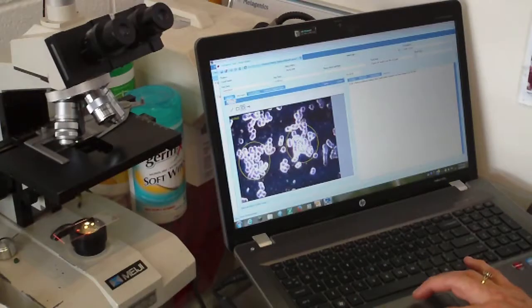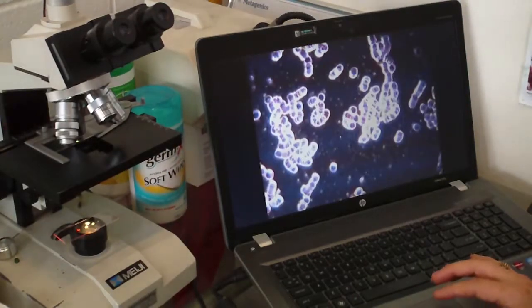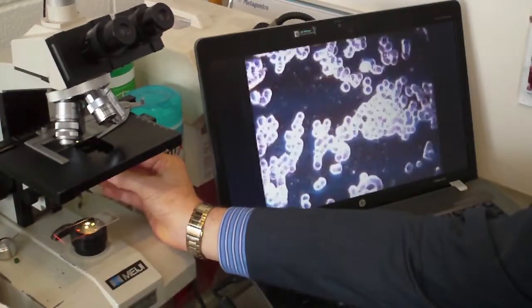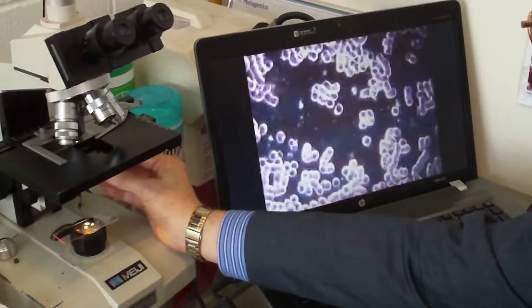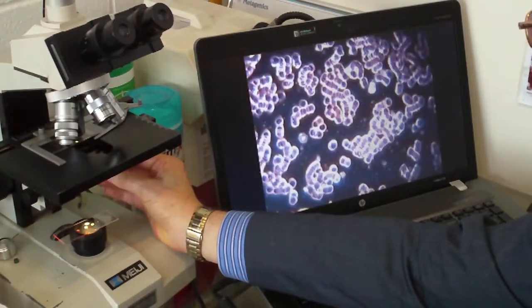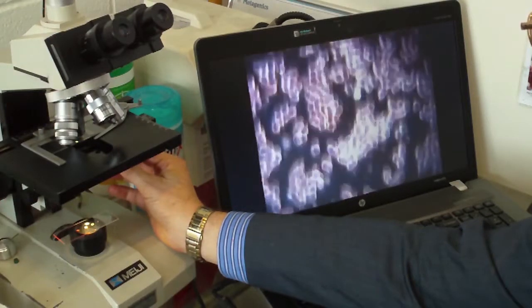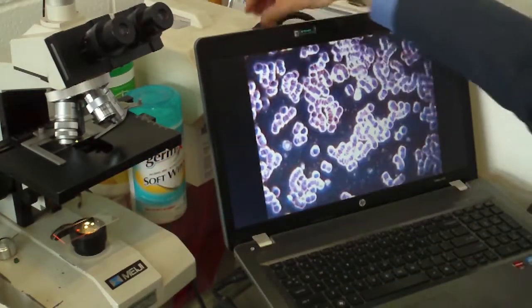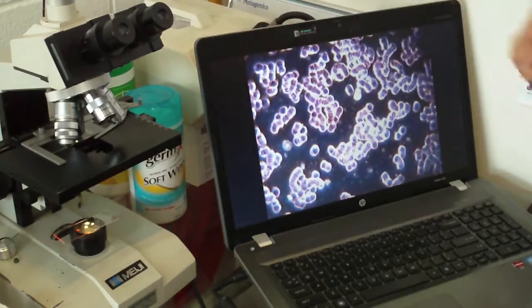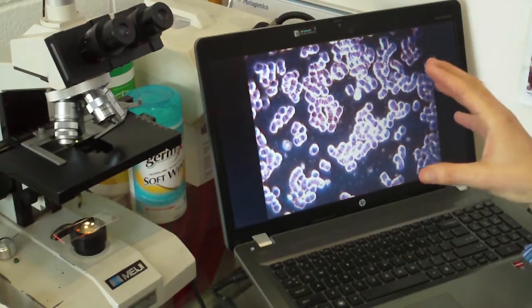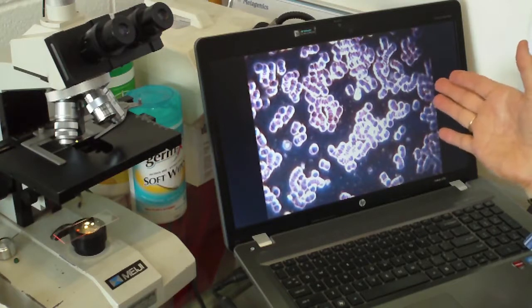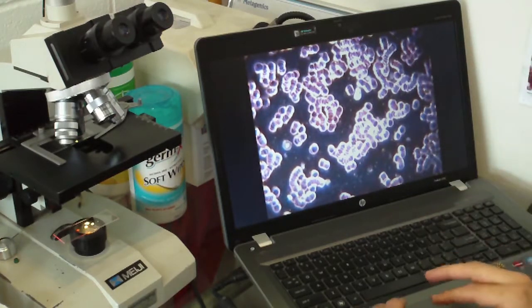And I put some comments in here. So this shows moderate Rouleau, which needs better hydration and more Omega-3s in the diet. Now we go back to the sample. And I'm going to go through a process of snapping pictures so I can get really clear exactly what's going on in the blood. So here we've got a lot more Rouleau. And this is a bit more serious in this patient.